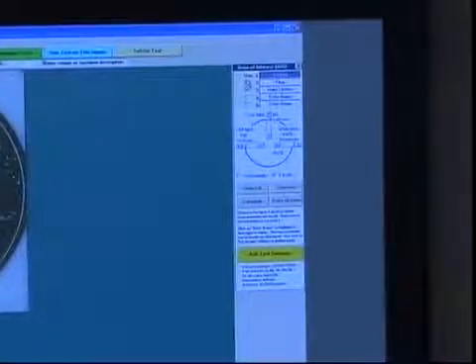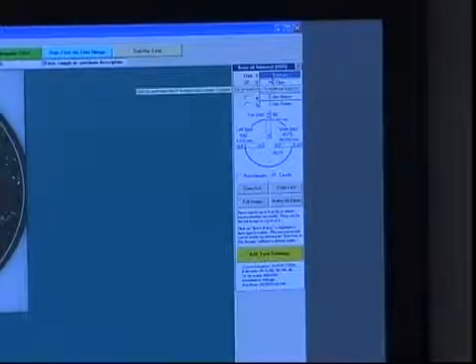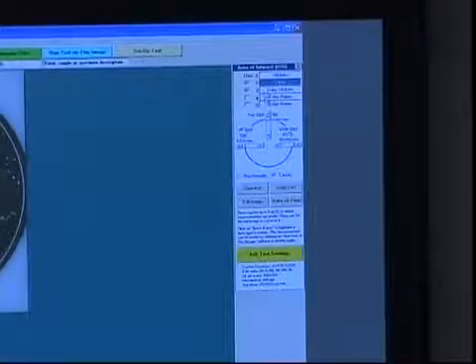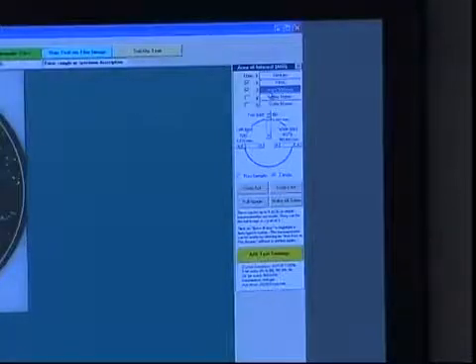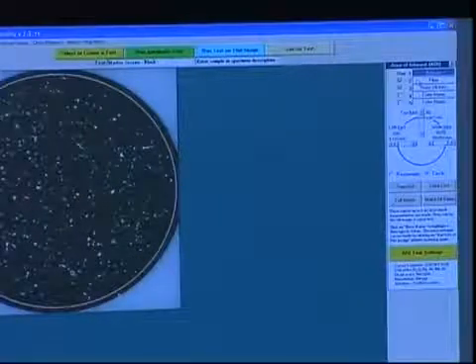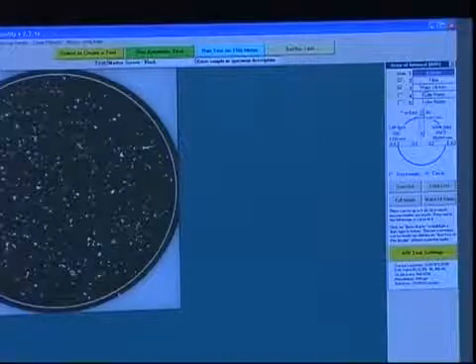We're set up to use only the first 3: stickies, fibers, and hairy stickies. We'll go into the setup. Now, each one of these has its own AOI. I don't know whether you can see the screen flicker when the new AOI comes up, but each one of them has exactly the same AOI, or area of interest. But in the measurement, all 3 will be independent measurements.